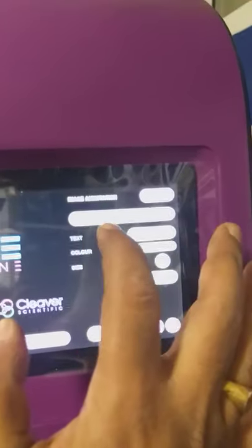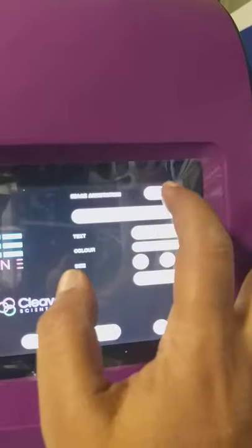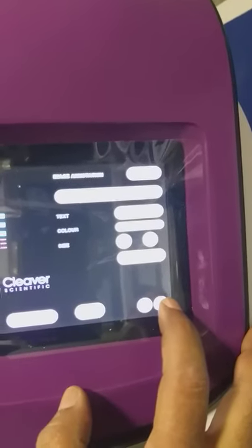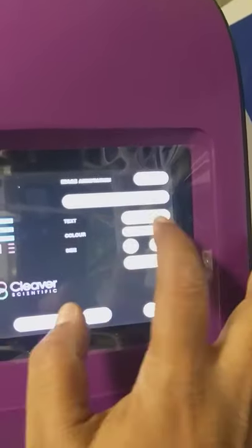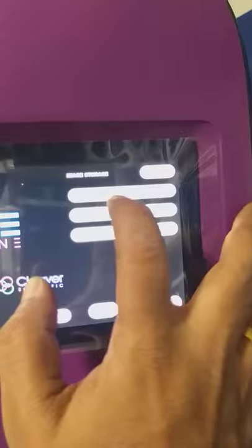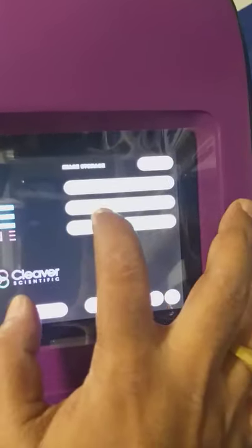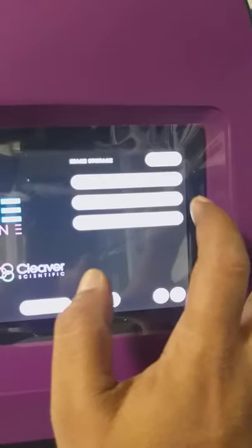So if you want you can set as such. Otherwise, comes to next step — image annotation. Then comes to next texture. If you want to edit whatever you want, color also you can select. Same as opening the saved image — whatever image you are getting, that saved image — then rename saved files.